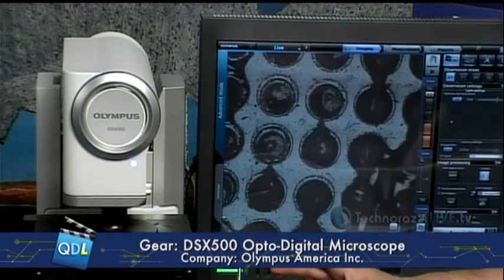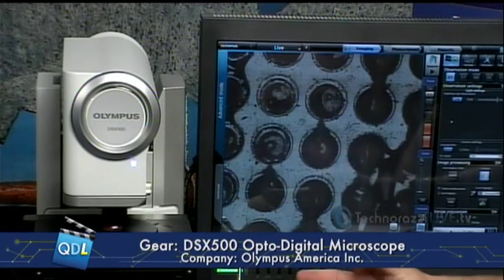It's a brand new opto-digital microscope from Olympus America Inc, the DSX 500. This tool has some truly unique features and functionalities. I'm joined by Rob Bellinger, an applications engineer with Olympus. Rob, you're here today to show us the Olympus DSX 500 — the new opto-digital microscope.